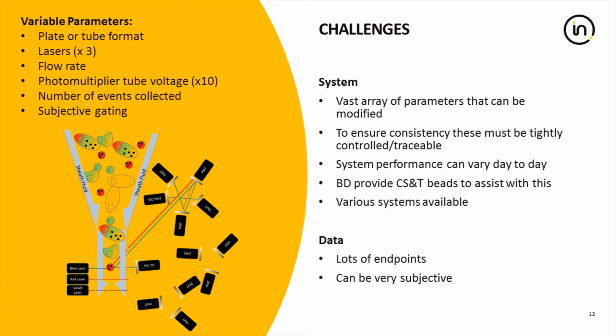So another challenge is the wide range of instruments available. There are a dozen or so manufacturers making a wide range of models. When you're transferring a method from another site, it's really important to consider this. You must take into consideration the laser and filter setups, and if the fluorochromes will be appropriate for your machine. In some cases, it might be better to start from scratch rather than making compromises, trying to crowbar a method in to fit another instrument.